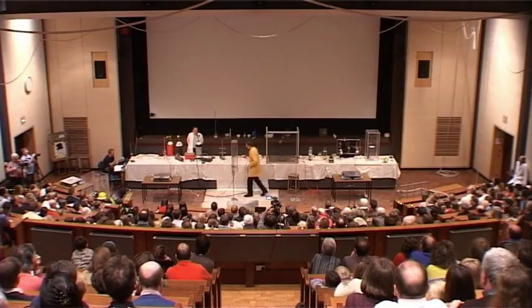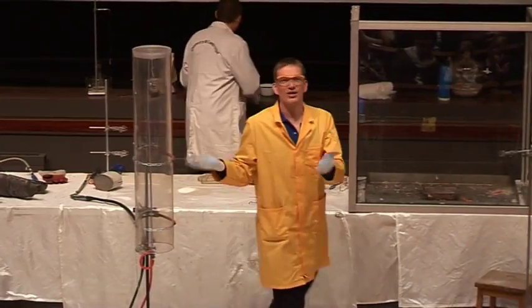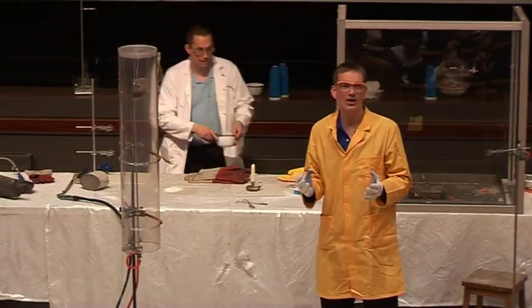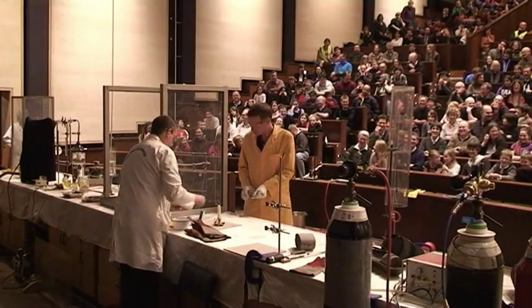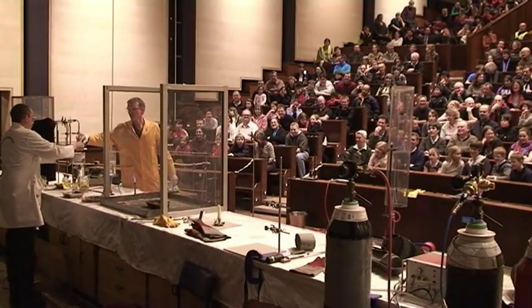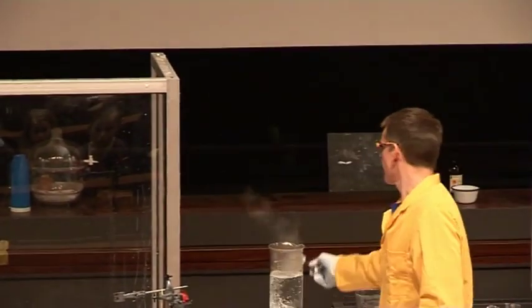Right, now, phew, so far so good. Well, I thought, okay, so we can light oxygen inside hydrogen, but could we set fire to a piece of paper soaked in petrol in hydrogen? Right, well, let's give that a try. So here's some paper, just to show, soaked in petrol, burns very nicely.